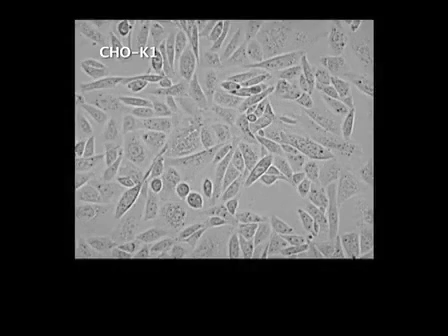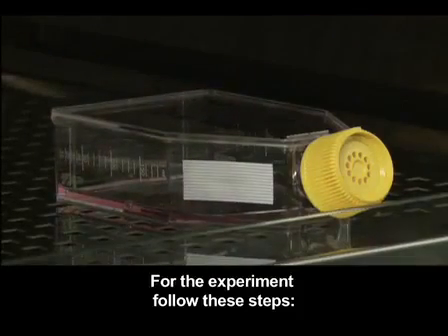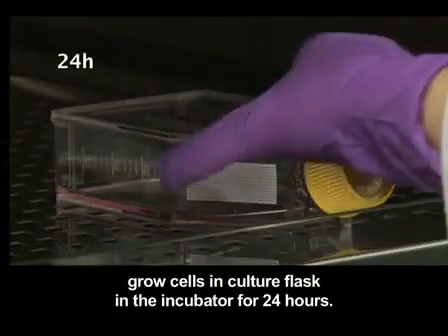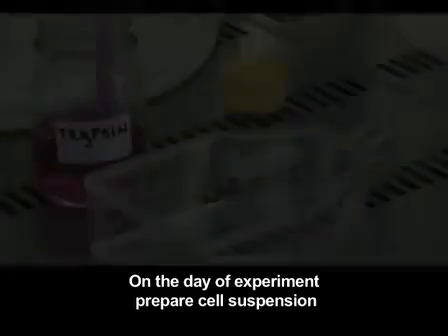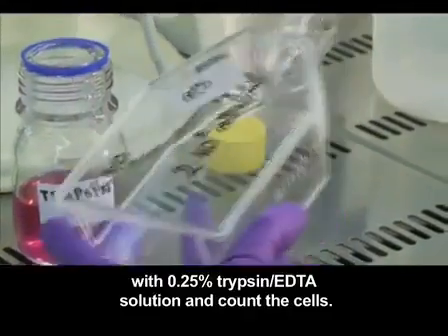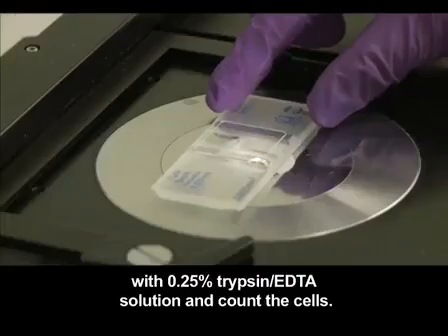Experiments were performed on Chinese hamster ovary cells, CHO-K1. For the experiment, follow these steps. Grow cells in a culture flask in the incubator for 24 hours. On the day of the experiment, prepare cell suspension by trypsinization with 0.25% trypsin-EDTA solution and count the cells.